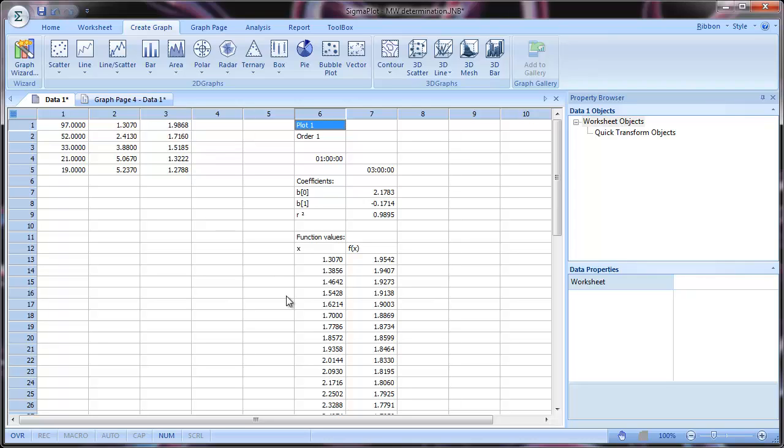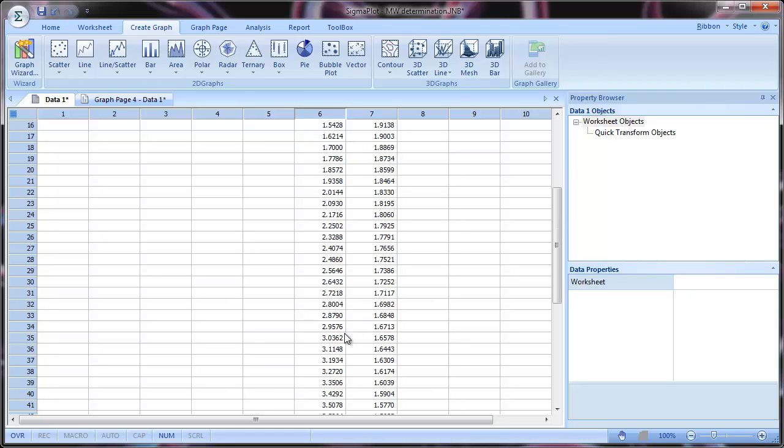And so then you determine the distance from the origin for your sample, and then locate it here, and then get the anti-logarithm of the corresponding number, and then you get the molecular weight. So it's a very simple way, in case you wanted to know exactly the molecular weight of a protein, for example, to send it for mass spectrometry.